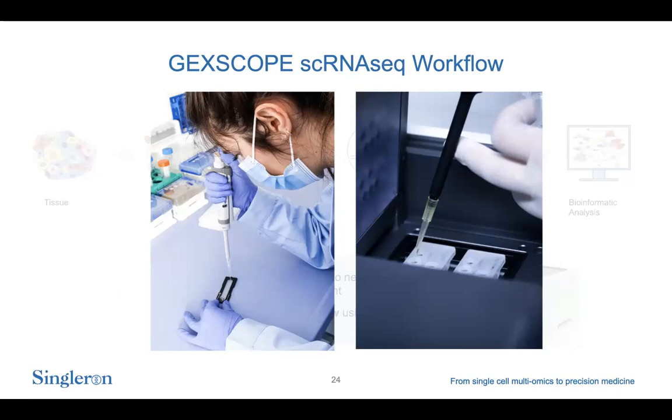What is important to know is that, for instance, the position of the pipette should always be at 90 degrees. You should pipette very slowly, and you should have dedicated pipette tips that fit the opening of our chip. Of course, we provide all this information in the user guides that come together with our products.